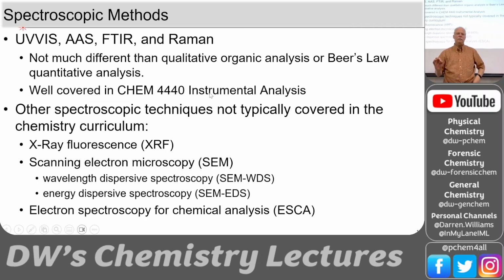Let's look at some of the other spectroscopic techniques. I'm going to rely on UV-vis, flame AA, and the basics of FTIR and Raman having been covered well in 4440. So let's look at X-ray fluorescence, scanning electron microscopy, and this ESCA.